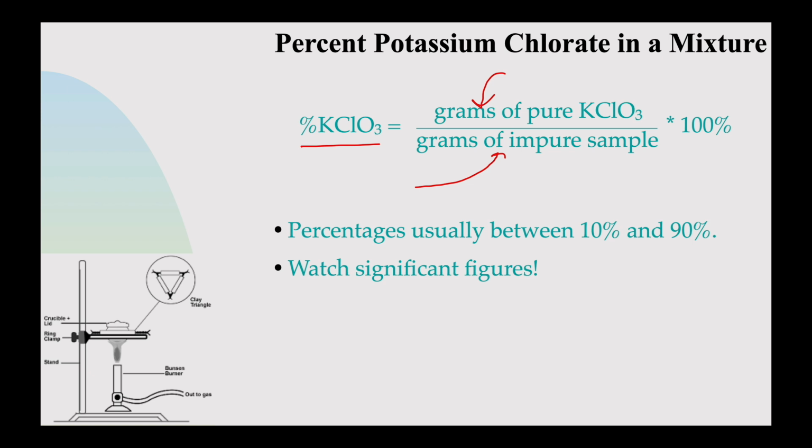On this lab, make sure that you watch your significant figures, all right? There's going to be a couple of things in there to watch for. This is good chemistry measurement here, so we've got to do it. But otherwise, it's pretty chill. So the goal of this lab, tell me the percent of KClO3 in the mixture. And all those steps we just went through should be good to go.